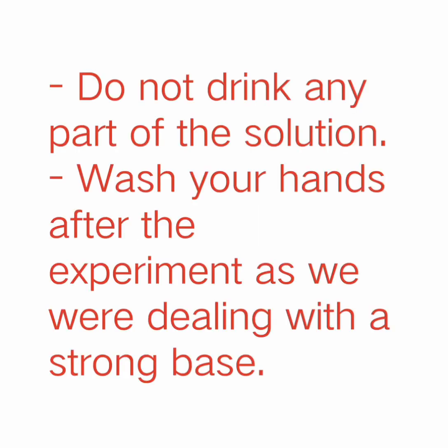Precautions. Do not drink any part of the solution. Wash your hands after the experiment, as we were dealing with a strong base.